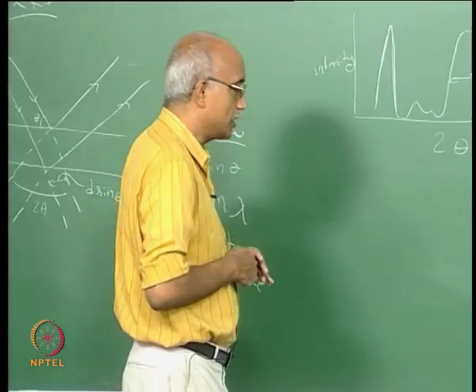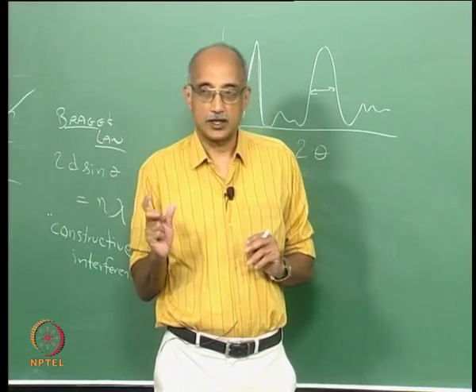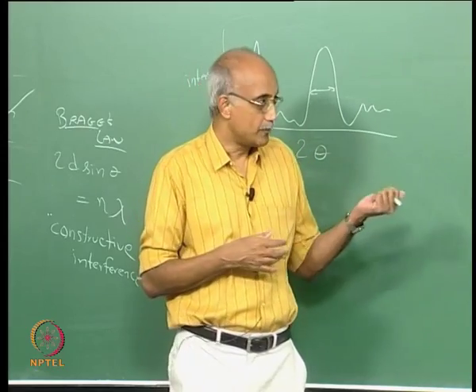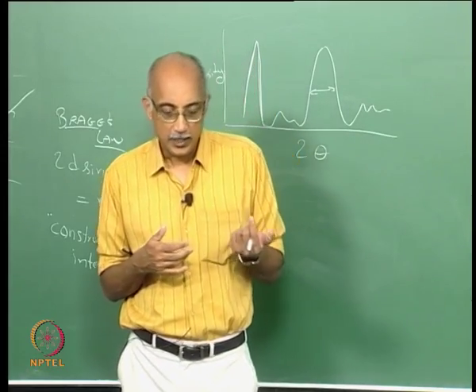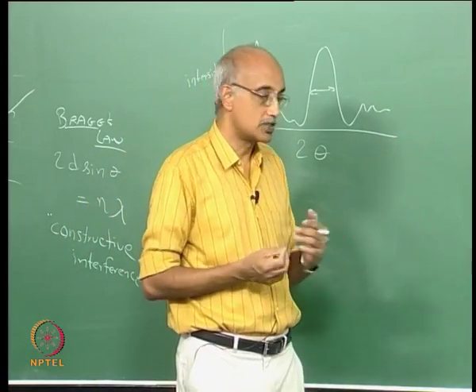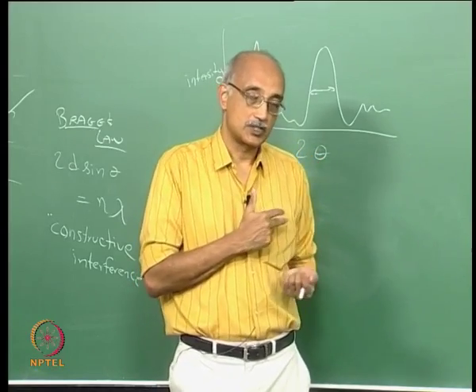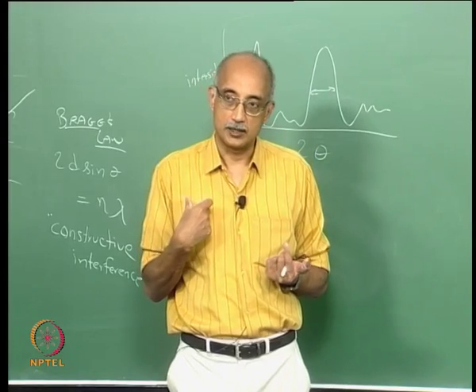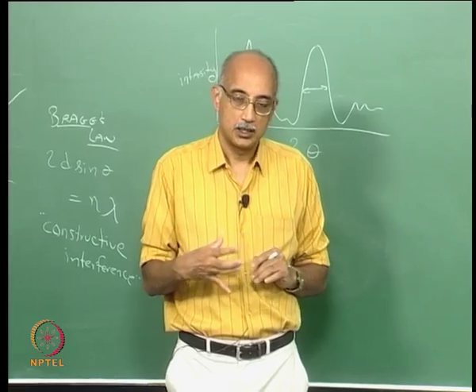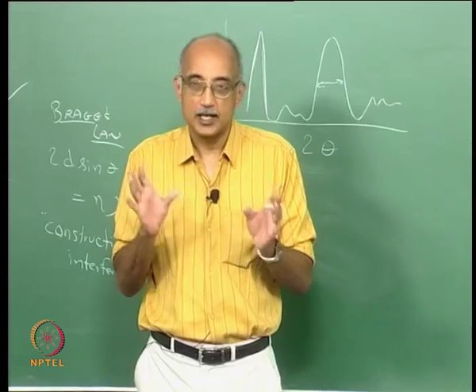XRD is predominantly used in qualitative mode for doing qualitative characterization of the crystal structure of a material. AFM, on the other hand, can be used very effectively in a quantitative mode. In fact, that is another thing that distinguishes an atomic force microscope from the microscopic techniques we have discussed earlier, as well as the XRD technique. These are essentially qualitative characterization techniques, and therefore they provide a certain type of data.